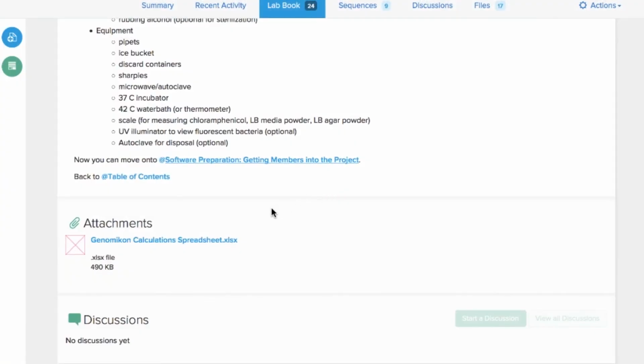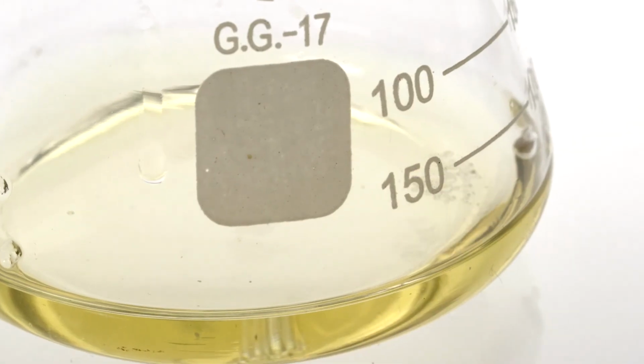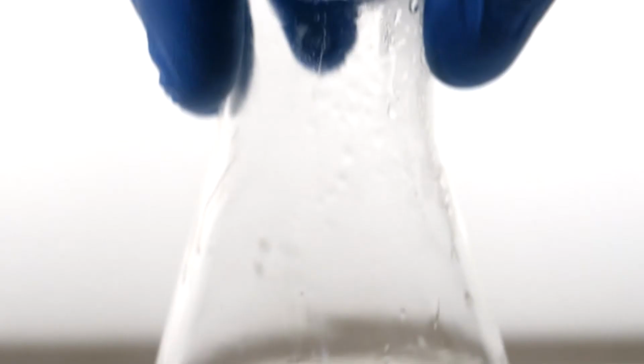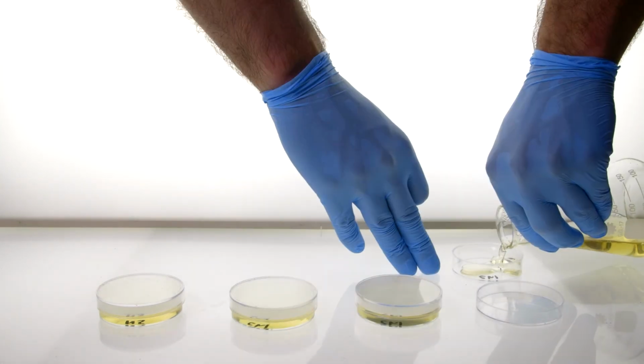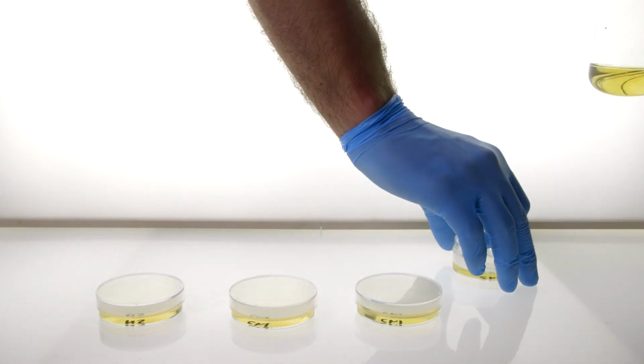See the calculation spreadsheet in your Synbiota project to see how much chloramphenicol to add. Collect your chloramphenicol from the freezer and add the required amount to your hot-to-the-touch molten agar. Make sure you mix it in by swirling. Then pour the remaining plates the same way. Once you've poured all of your plates, let them cool and solidify overnight at room temperature.